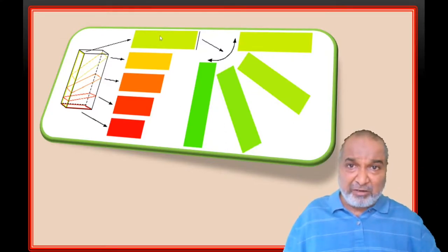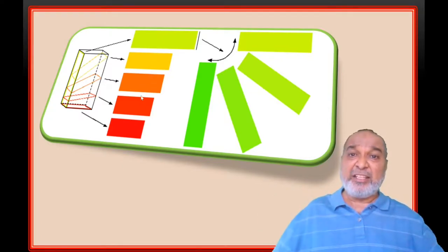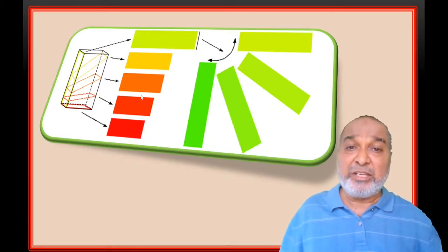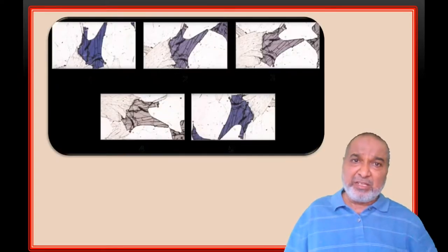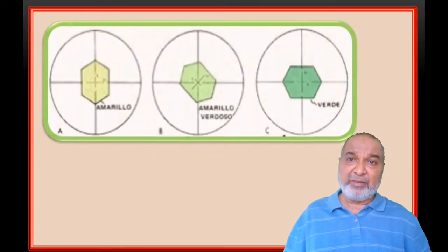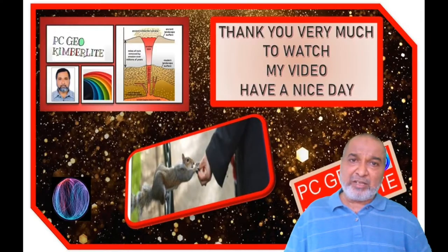But here on your left hand side, what is happening? From one color, there is a change into another color. So it is qualitative pleochroism. Now here again, there is a mineral. As you rotate the stage, you will find there is a change within one color. It is quantitative, again a quantitative one. I hope I made the concept clear.